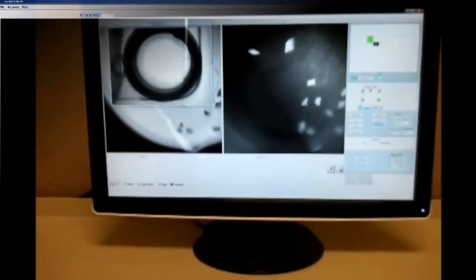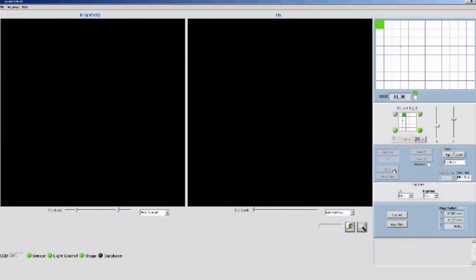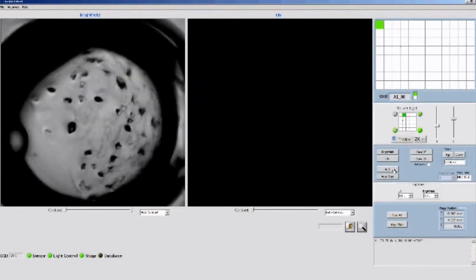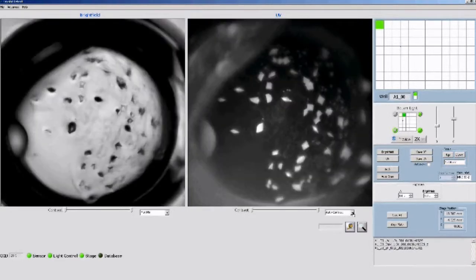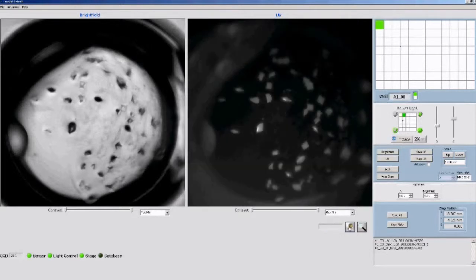Here is the live video as the joystick is operated. The user interface is fairly straightforward. There are two large panels that display the bright field and the UV fluorescence images respectively, as they come out of the camera. There is no processing. The only thing is the contrast is arbitrary, and the user can adjust the contrast to make certain features pop out.